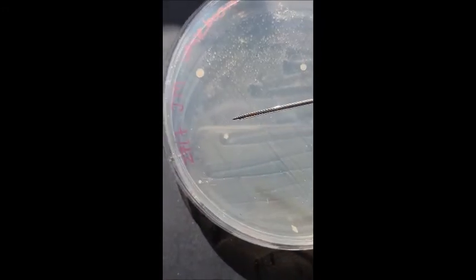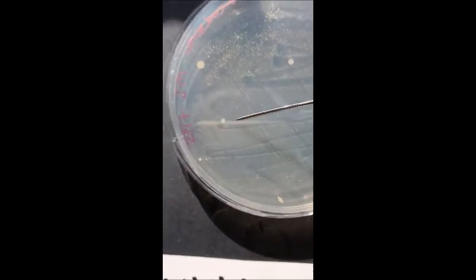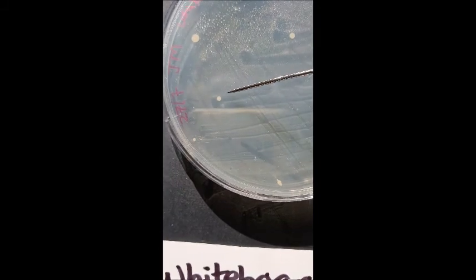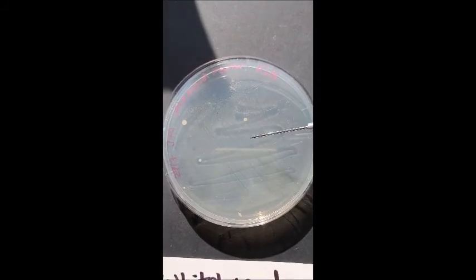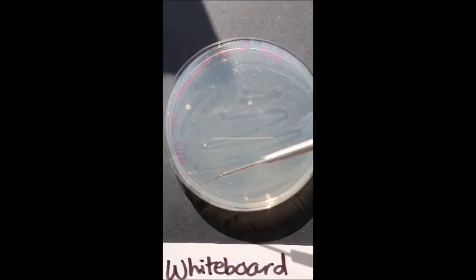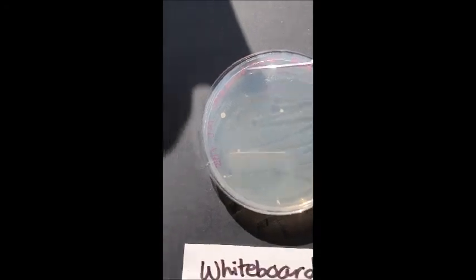And this one, it's not as round, but it's still bacteria. You can tell they're bacteria because they're in colonies, and they're usually kind of smooth and shiny. So yeah, whiteboard marker: 1, 2, 3, 4, 5.